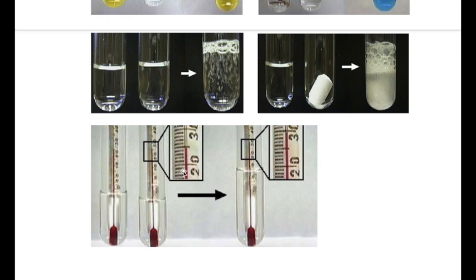Let's say this goes down to 20 degrees Celsius, for example. So there will be a sign of an endothermic reaction.